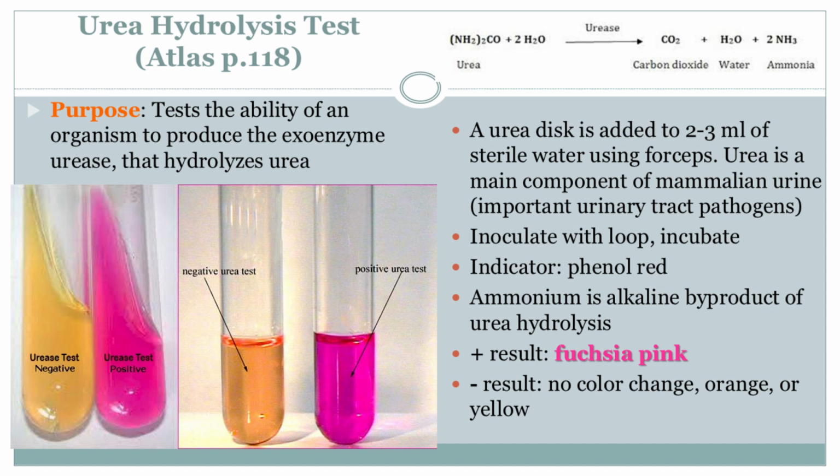Okay, so urease and urea, what's the connection? Urease breaks it down. Breaks it down, like into what? Into ammonia and carbon dioxide. So urease is like this little chemical machine that transforms urea. That's a great way to think about it. And it's the ammonia that really shakes things up. How so? Ammonia is a base. It makes its surroundings more alkaline, the opposite of acidic. Think baking soda versus lemon juice.